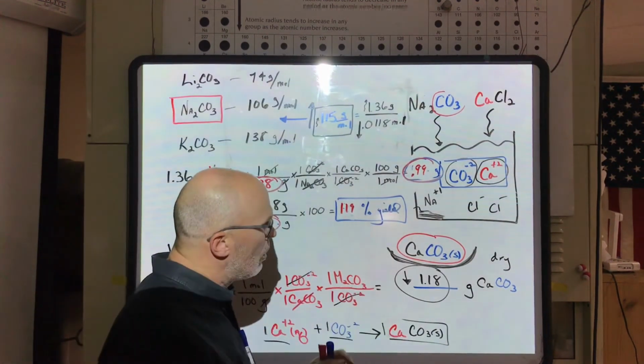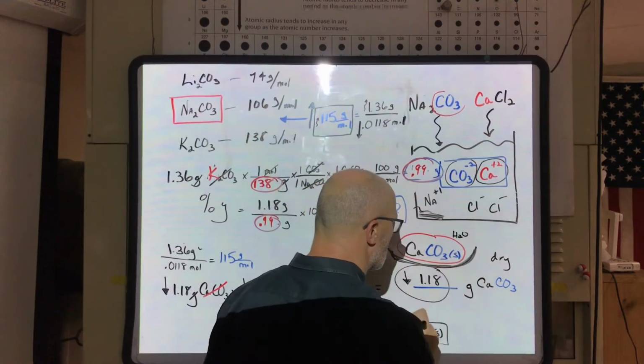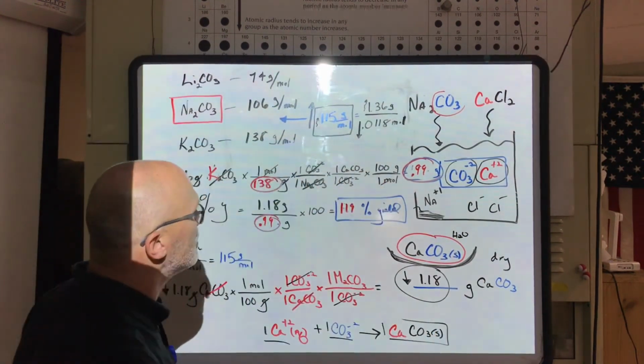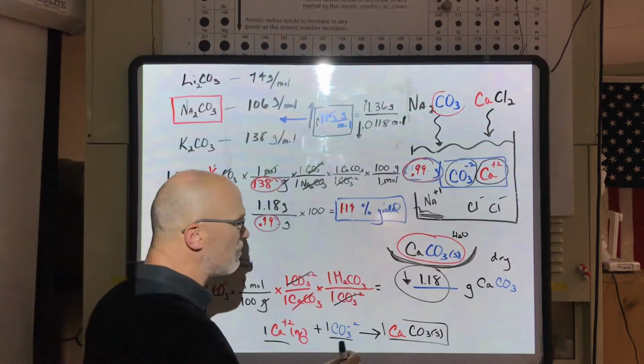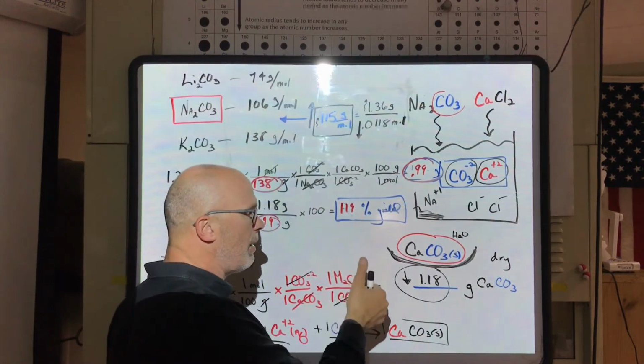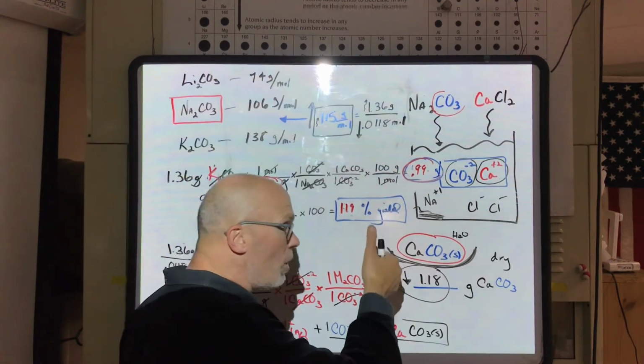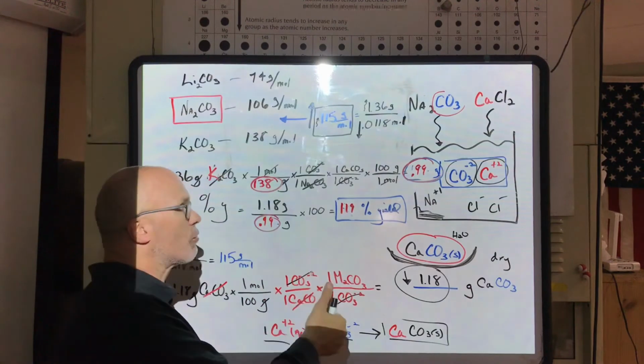to verify all the water was lost. So we could have some water here contributing to the mass, which means possibly the mass of my calcium carbonate is a little bit bigger than it's supposed to be. I know we said down, but you could have a scenario where I didn't dry it off.